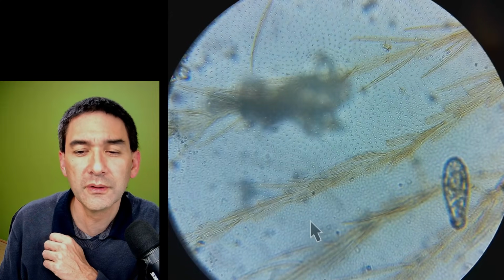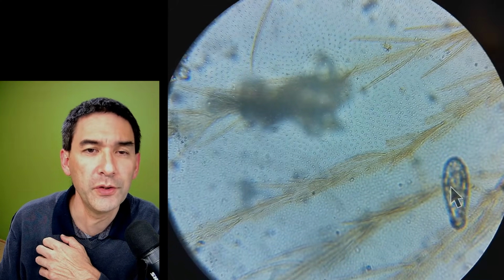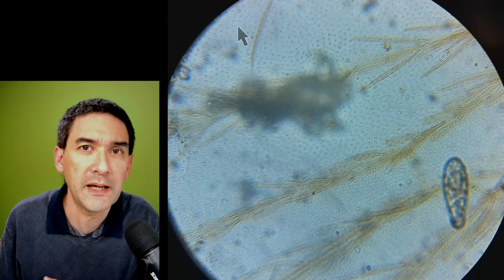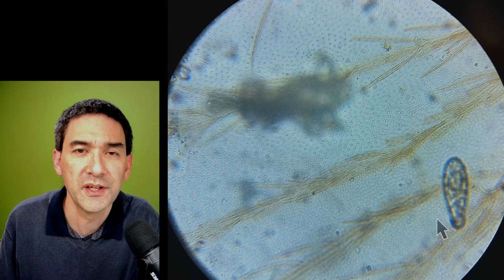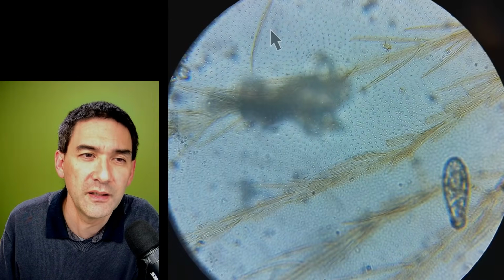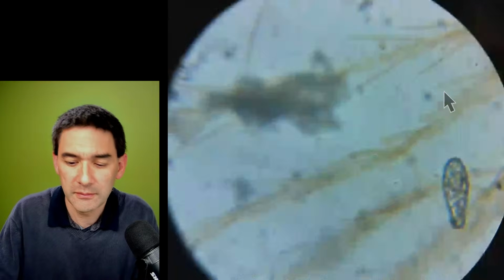Yeah. And with a mobile phone, you're getting the full field of view. And this also means, however, that if the optics are not very good, then you might actually see that here on the side. If they're not plan optics, on the side, it's a little bit fuzzier. Right, because plan optics are sharp all the way through, and on the side, the cheaper optics are a little bit fuzzy. Yeah? So let's have a look at another one.